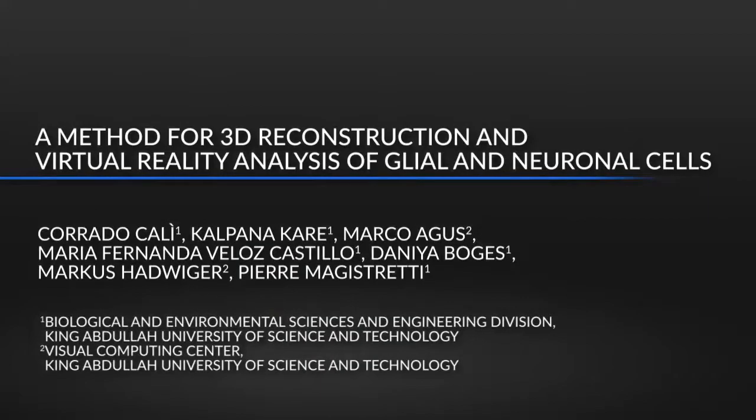With the diffusion of automated serial section electron microscopy techniques, the rate-limiting step in the pipeline leading to the generation of biological three-dimensional models has moved to image processing. Our protocol provides a step-by-step guideline to produce a dense reconstruction of image volumes in just a few days, combined with an approach for quantitative measurements using three-dimensional models.